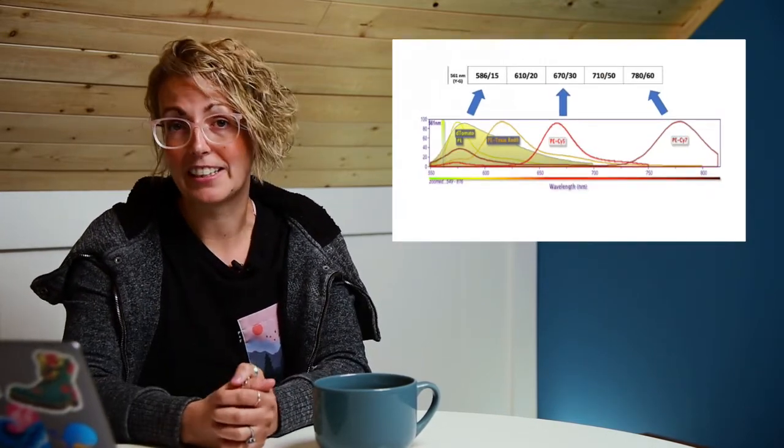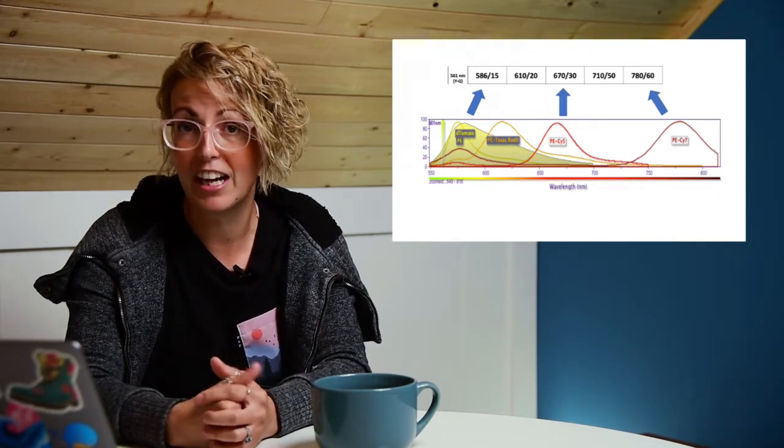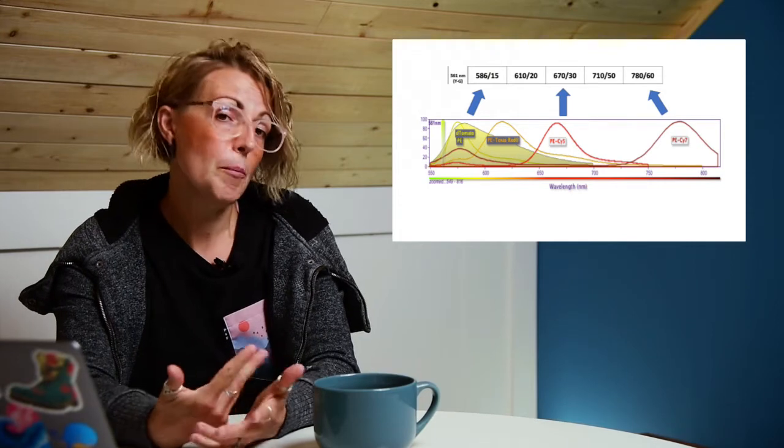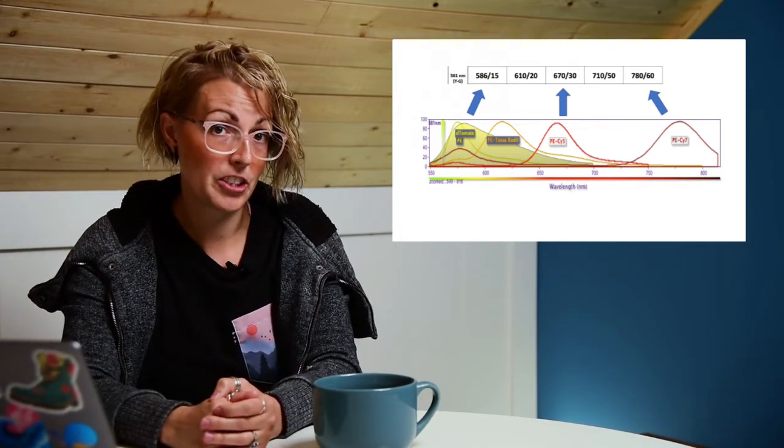That being said, we can still add more colors to this panel. Even though we might have multiple fluorochromes on a laser line, we can still reduce spillover by spreading them out across various filters. For example, if we look at our 561 nanometer laser line here, you can see we have a number of various filters coming off of that laser line. So we know PE is a bright fluorochrome, so let's select that as one of our fluorochromes of interest.